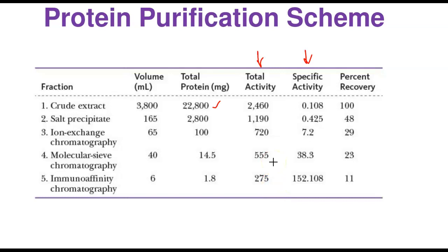The specific function of that protein, not the way it functions with other protein components, but individually, begins to increase. Look at it here. If you have a specific component, the more you are purifying, the specific activity of that protein begins to increase, because the specific function you're looking for begins to increase. And again, if you look at the percentage recovery, you find that as you go down these purification steps, the percentage recovery begins to decrease.